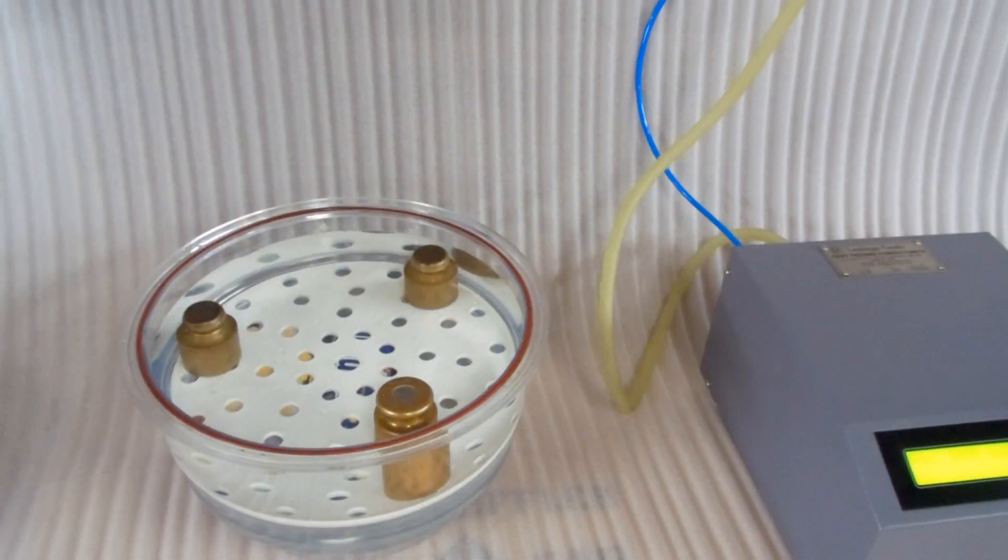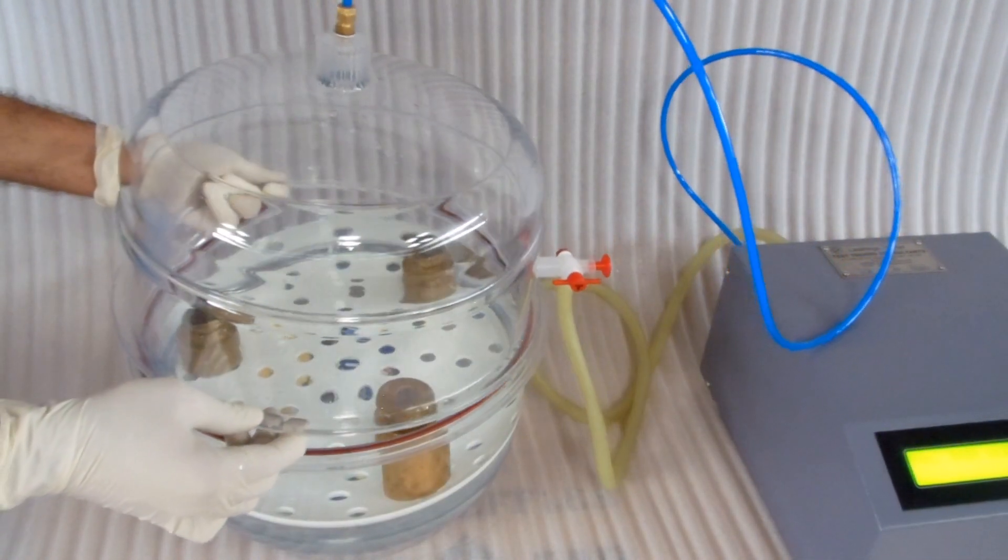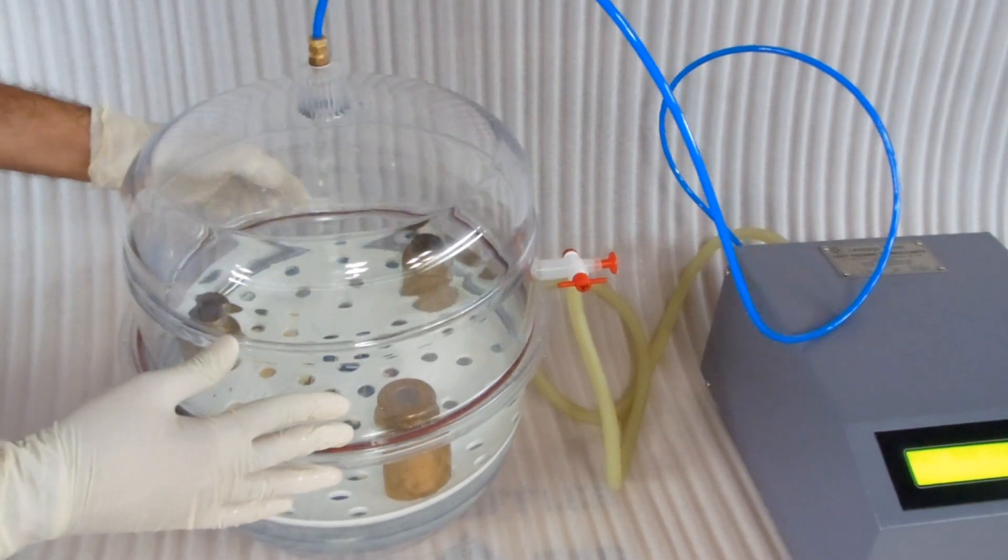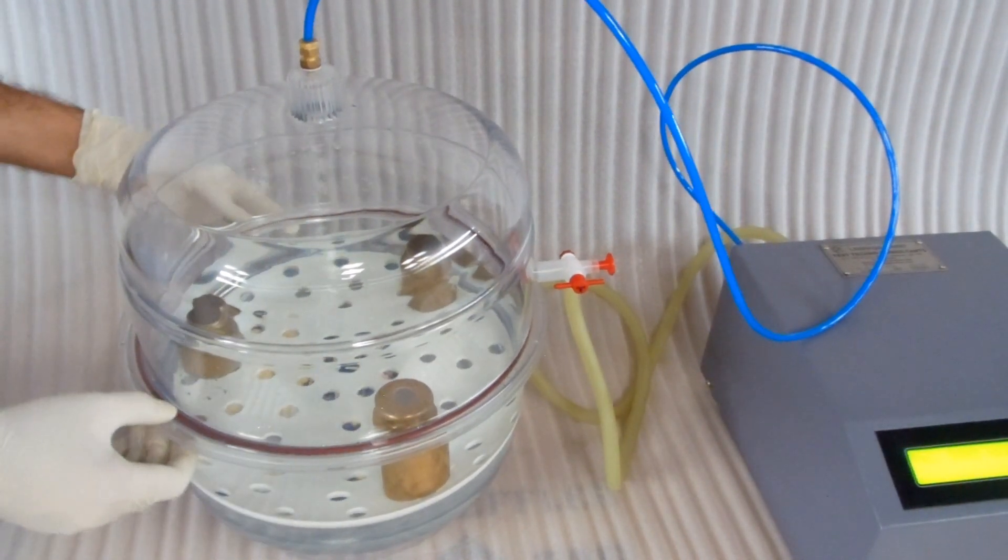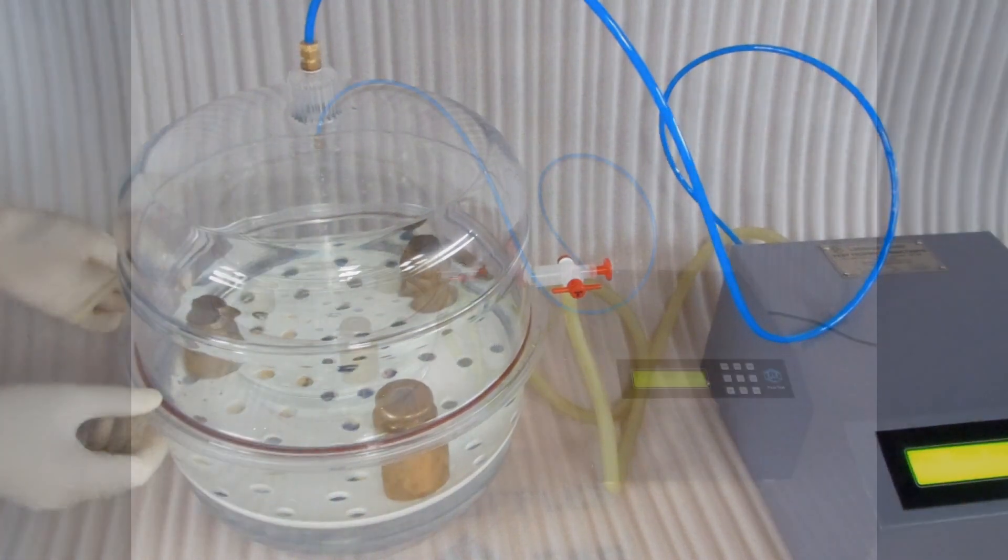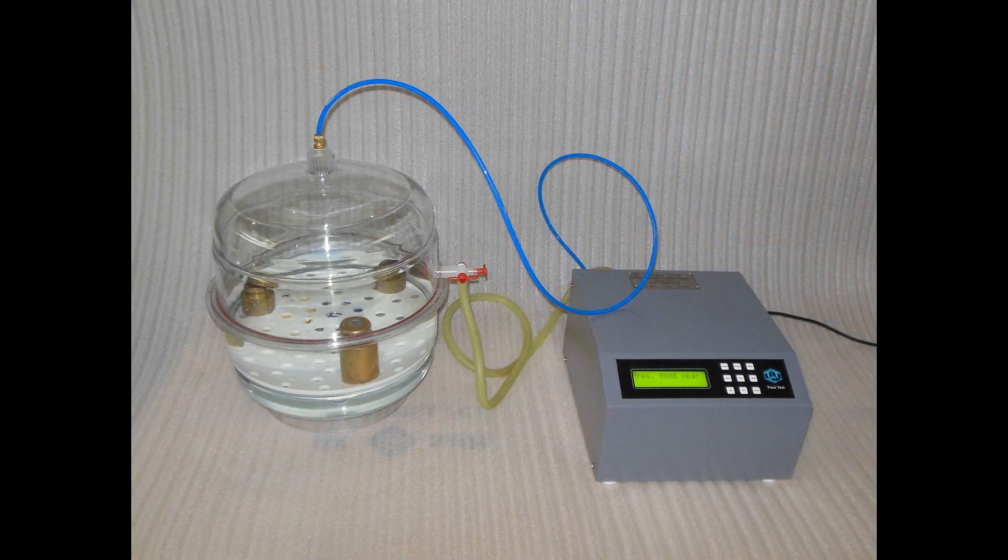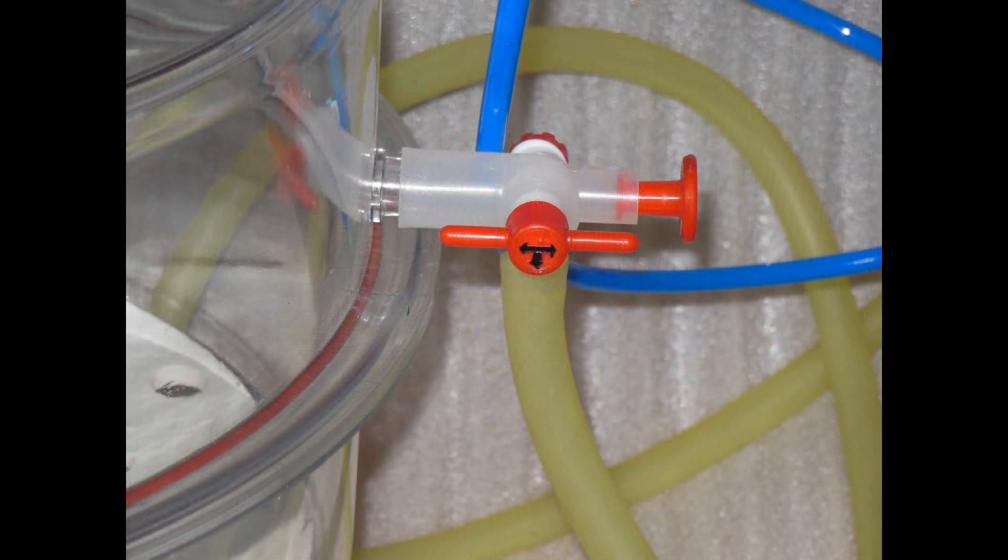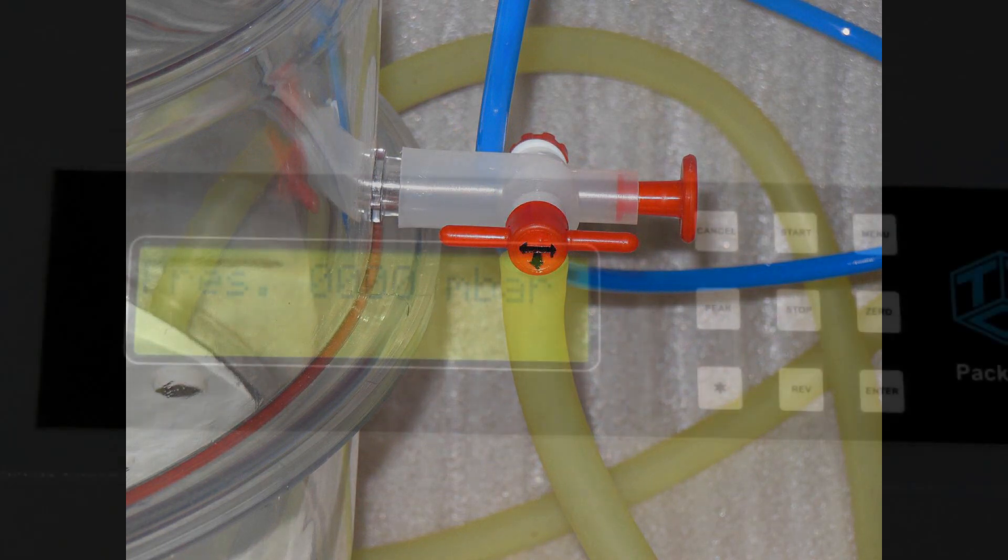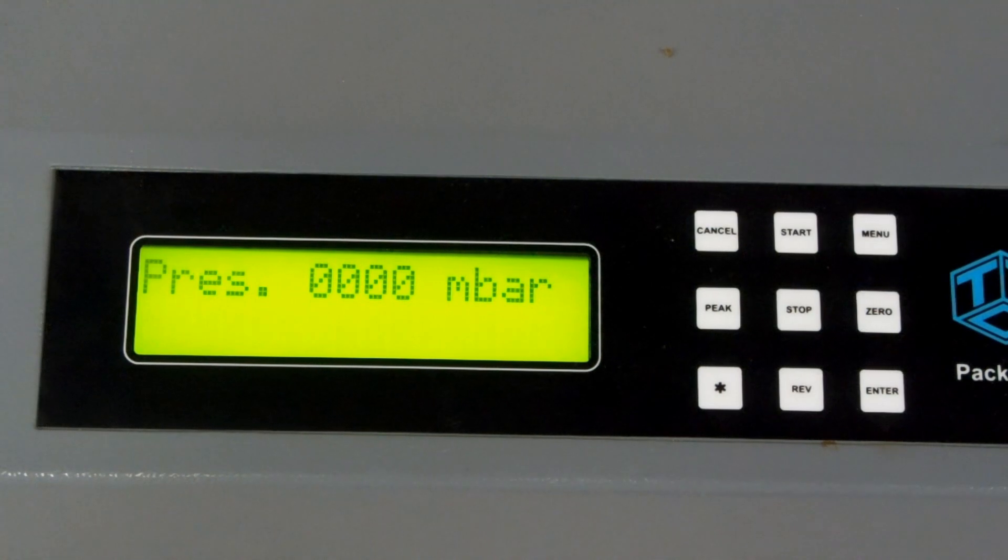Place the top half of the tank in its position. Make sure it fits properly. Make sure the red valve on the tank is positioned exactly like this. Let's see how to program the leakage tester.